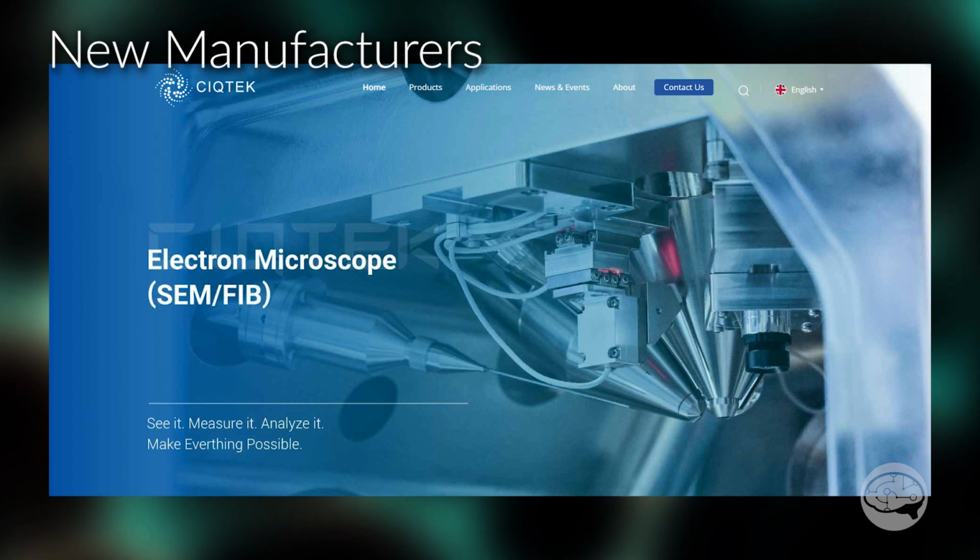But they also have a dual-beam FIB and a field emission 120 kilovolt TEM. So on top of that, they did also mention to me that they had a number of other different instruments in the works that were yet or soon to be released. They already have a distributor here in the United States and have a plan to open an office here within the next year or so.